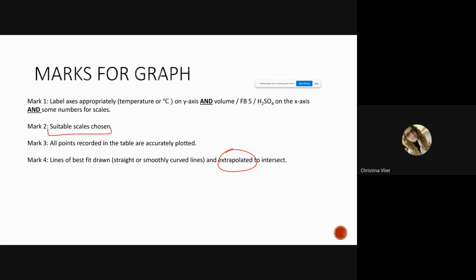What they said the requirement was is 2 degrees above your max. So you have to go to 35. You have to be there. Does that make sense? So I would choose 2 degrees Celsius, and I would choose 19 there.